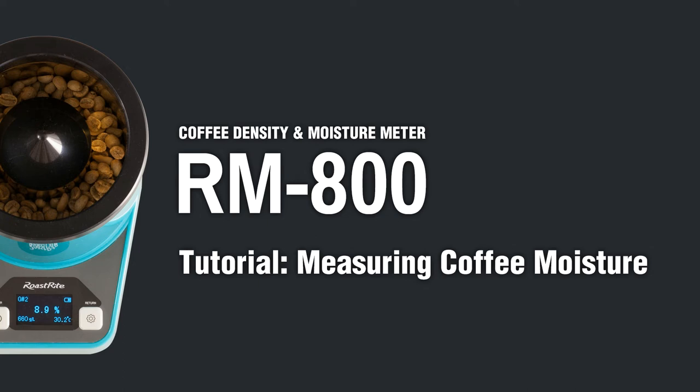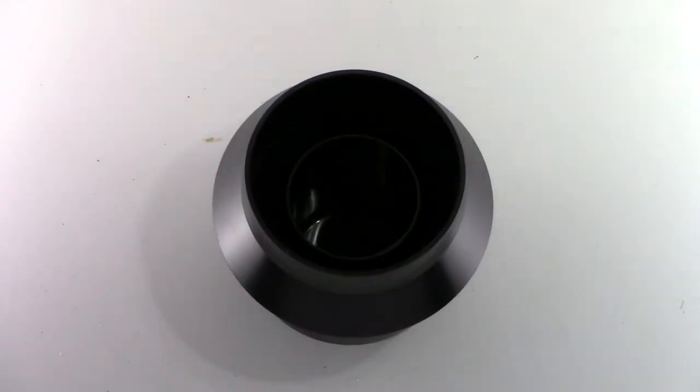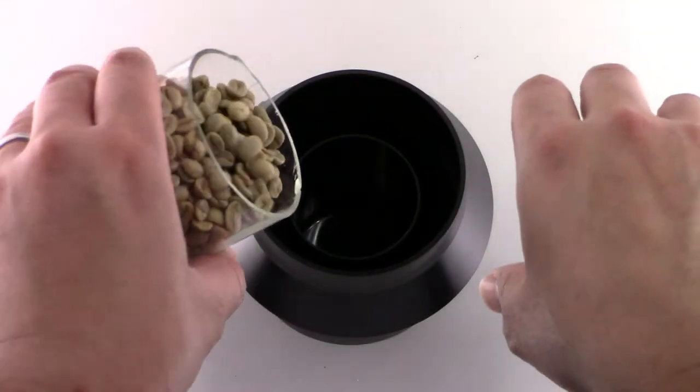Hello and welcome. In this video, we will show you how to operate the RoastRite Coffee Density and Moisture Meter for accurate results. Place the hopper on the measuring cup, then fill about 180 grams of beans into the cup until full.